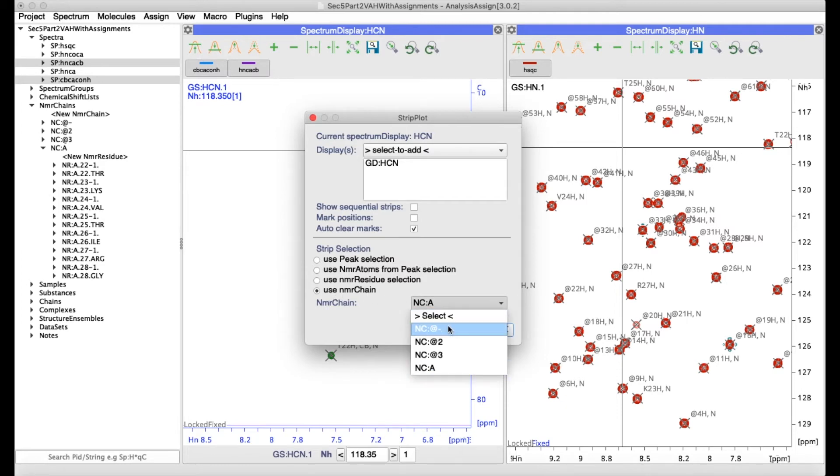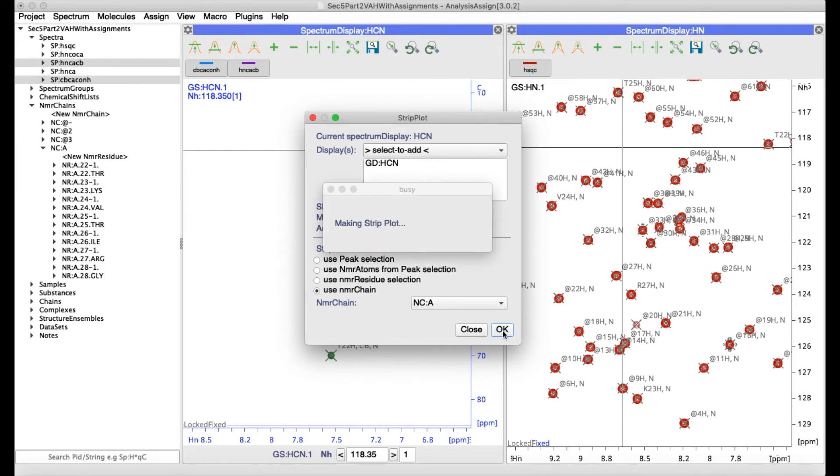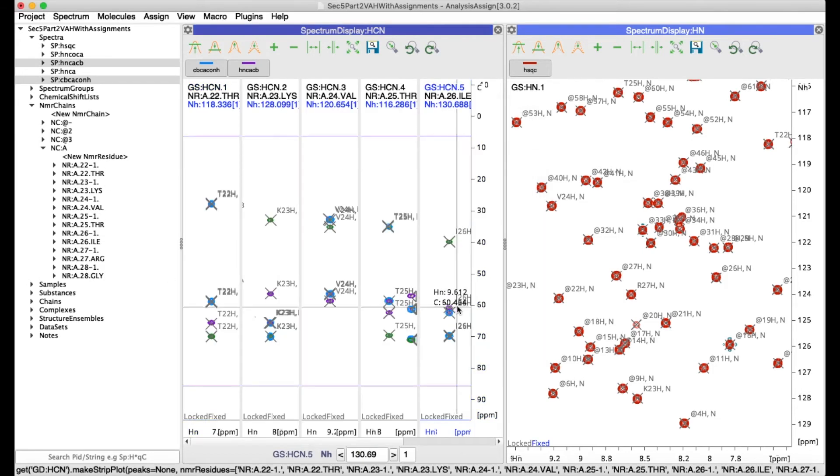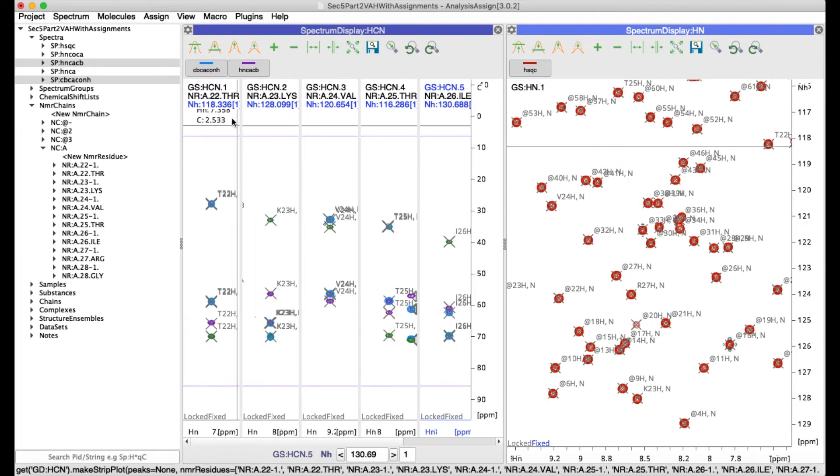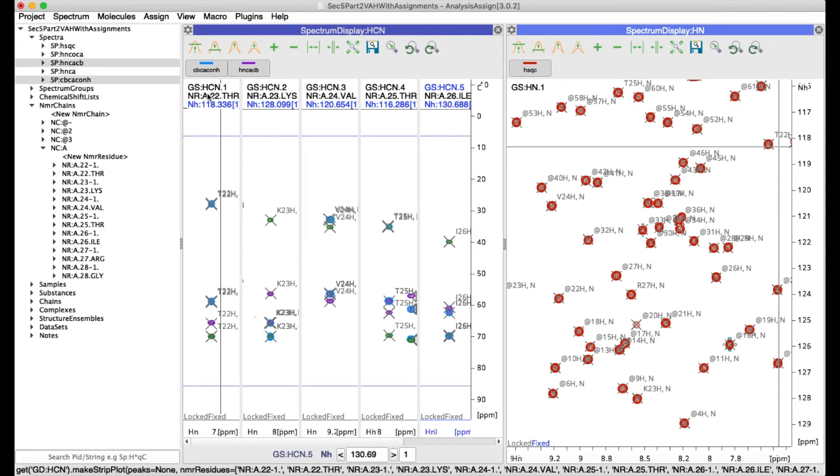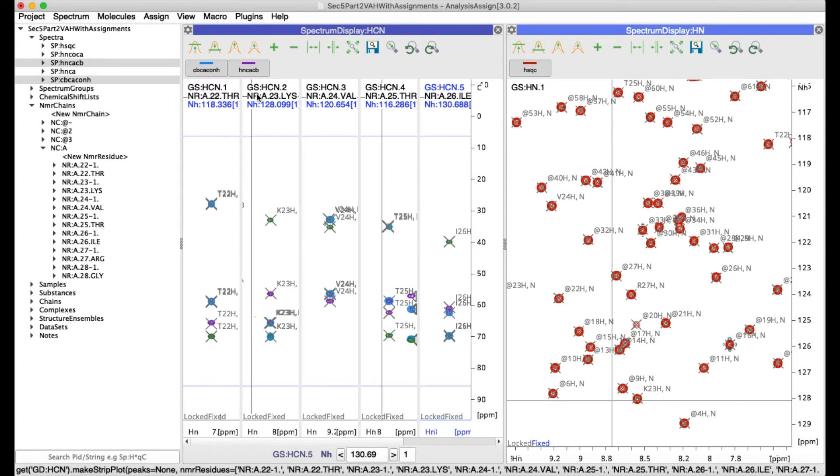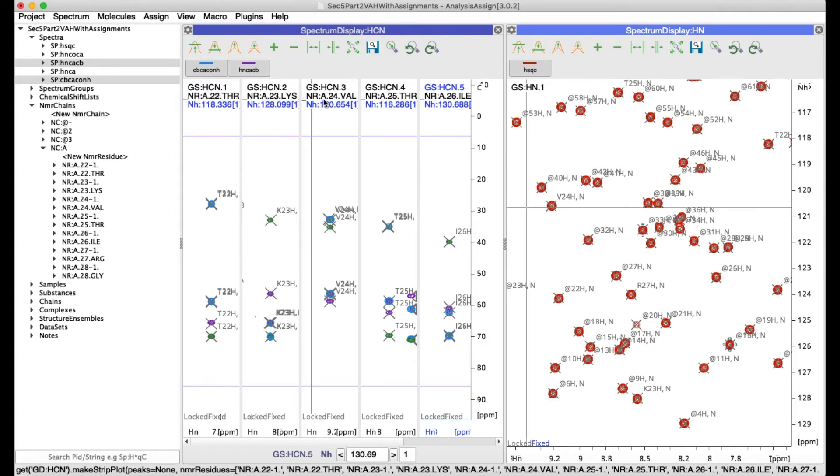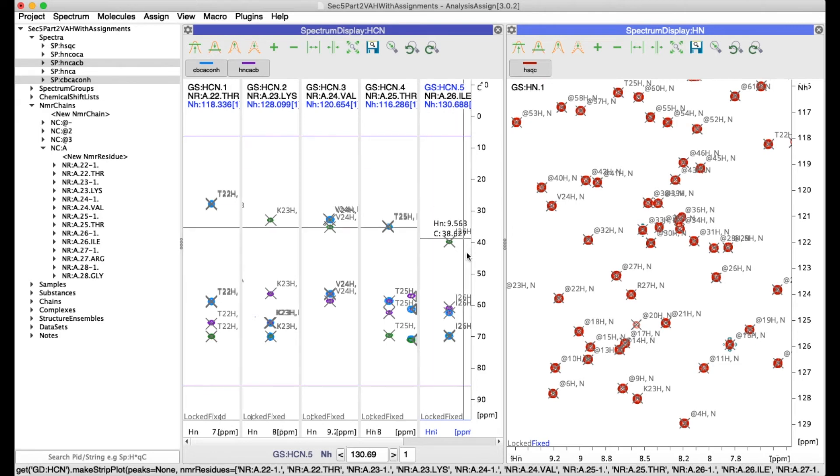So in this case I'm going to choose the A chain which has got a small stretch of assigned residues and now I've got all my strips and you can see each strip has an additional header with the NMR residue shown to which it belongs from which it is derived.